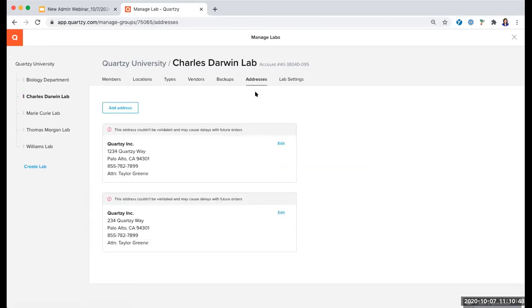Lastly, we have Addresses — keep track of all of your lab's billing and shipping addresses to make checkout even faster. That is a good point for me to pause now that we've gone over all of the lab settings.